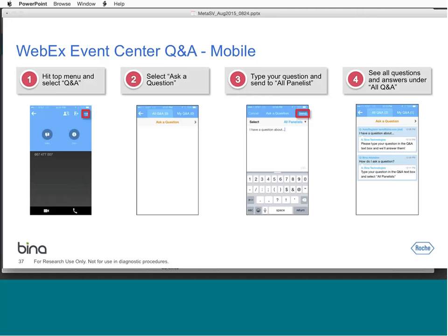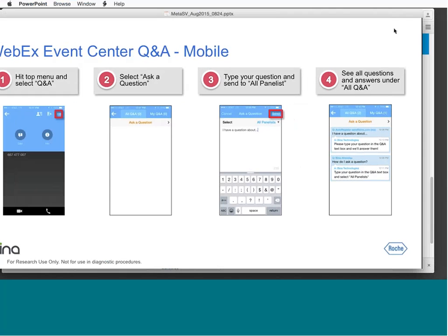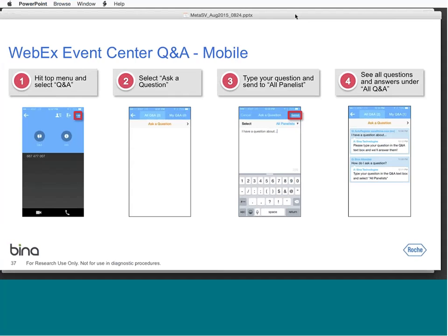Okay, the next question. What does it mean for MetaSV to run in the back end? Once you have selected one or more SV detection tools on the Run Jobs page, MetaSV always runs automatically by default. Because we don't enable assembly, the overhead of running MetaSV is only a couple of minutes, so there's no harm in reporting high confidence variants.